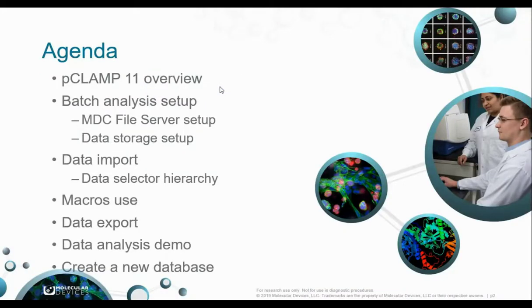Here is my agenda today. I will give an overview of pCLAMP 11, and I will talk about how to set up the batch analysis, how to import the data, how to use macros, and export the data. I also will do some demonstrations for data analysis. And at the end, I will create a new database.